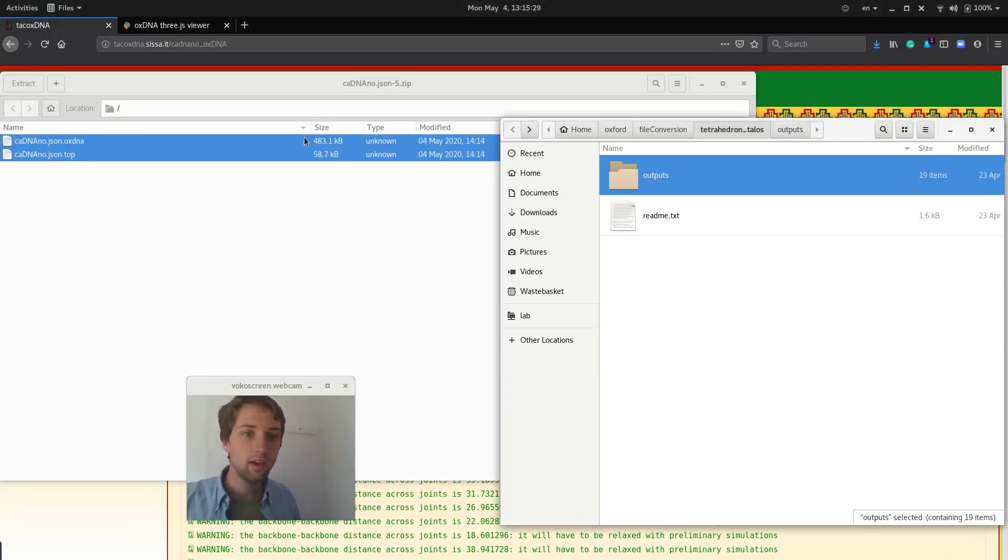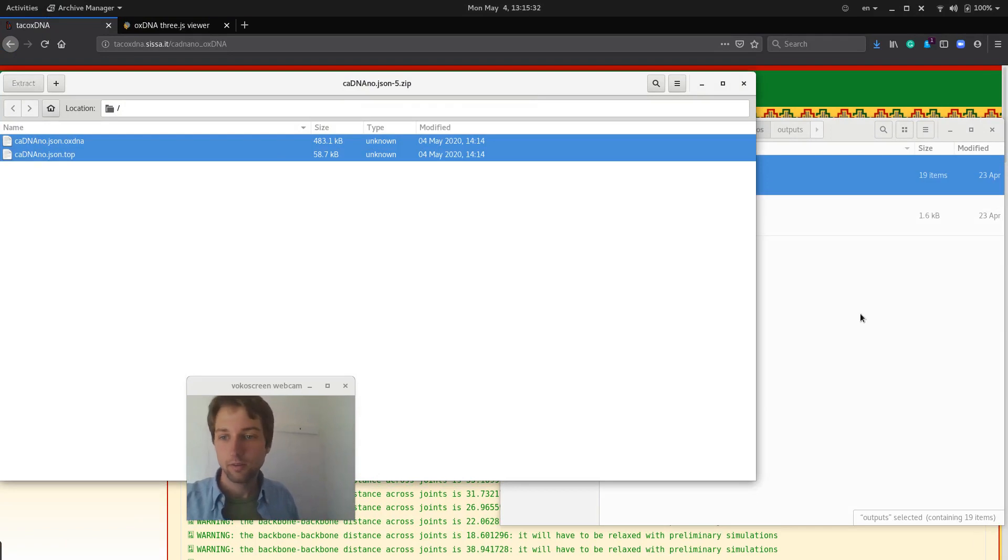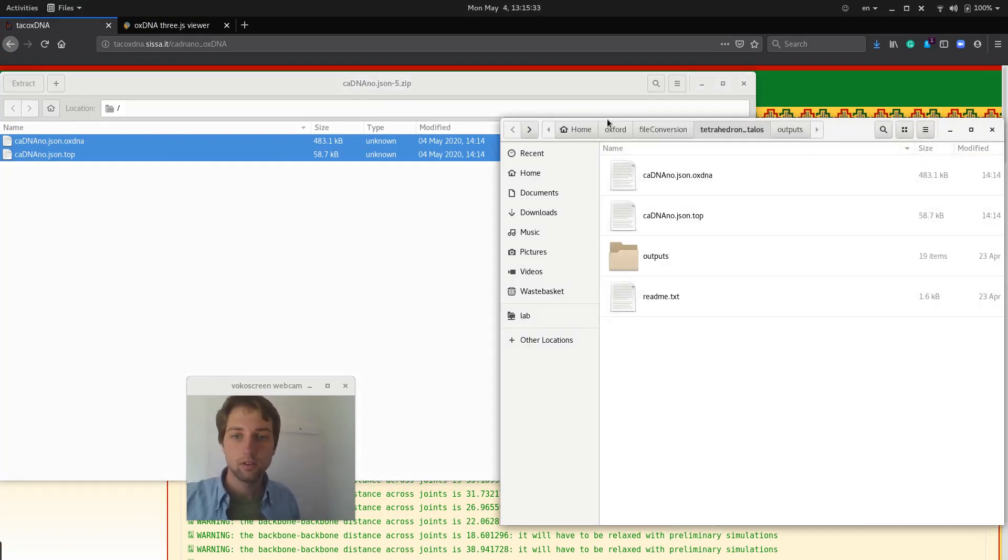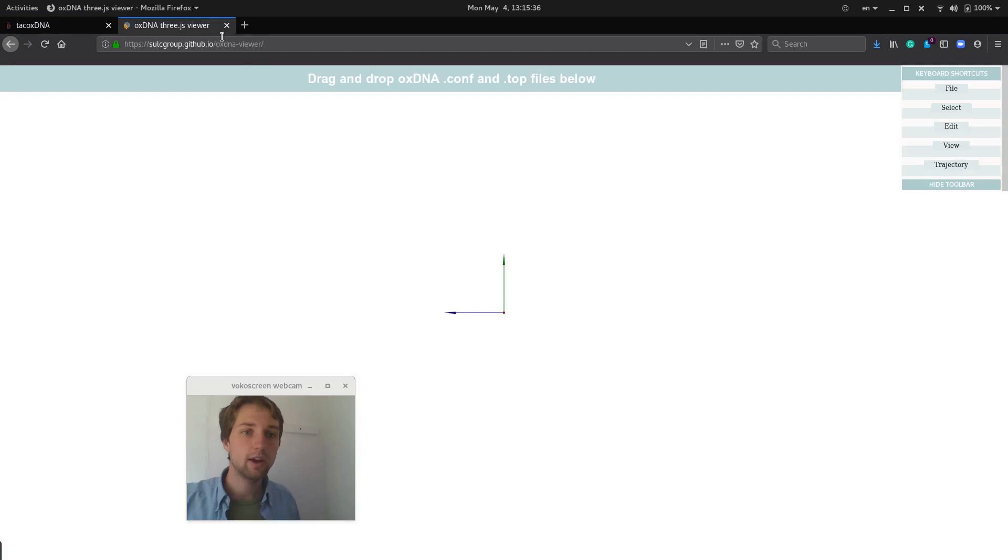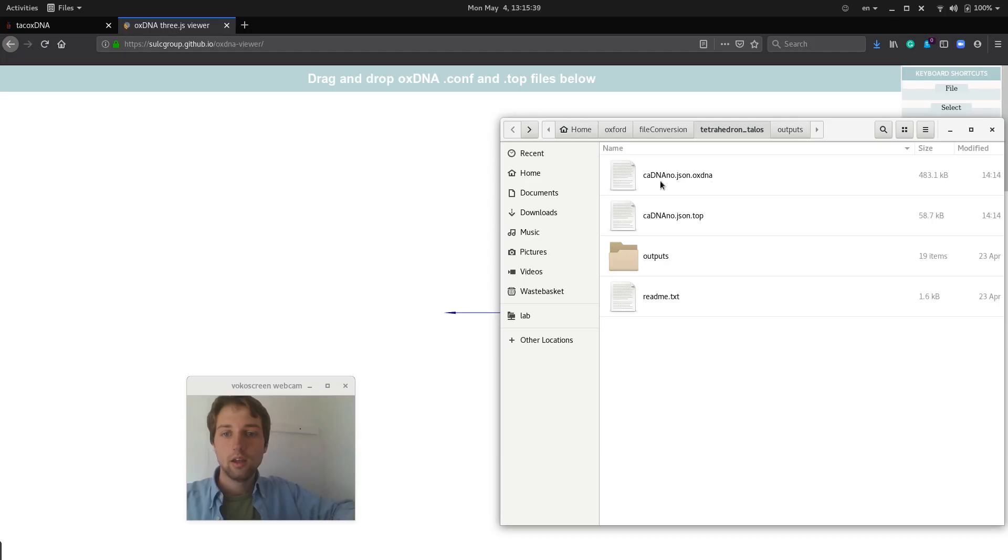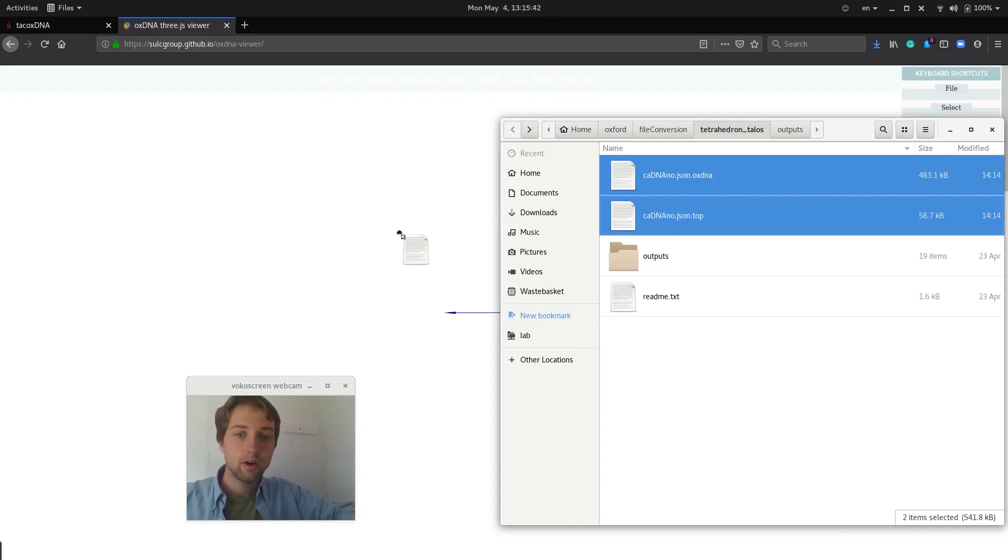Let's say here. So we have them there, and then we can just drag and drop them into our OxDNA viewer.